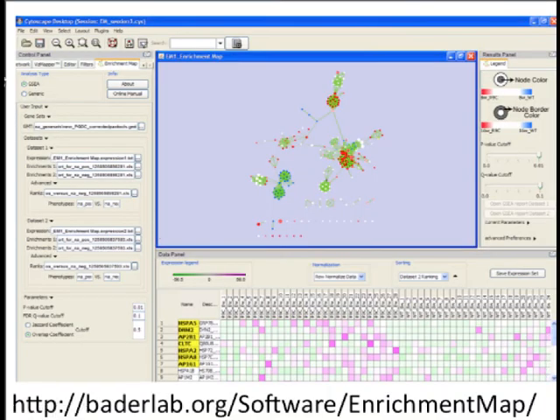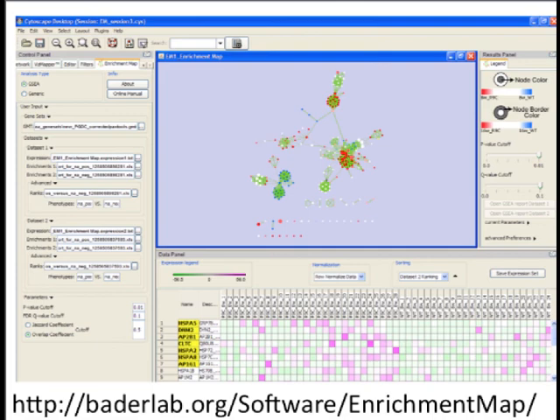Enrichment Map is an app you can get for Cytoscape — a free app. It allows you to load up your results from GSEA or g:Profiler and visualize them in a fairly straightforward way.